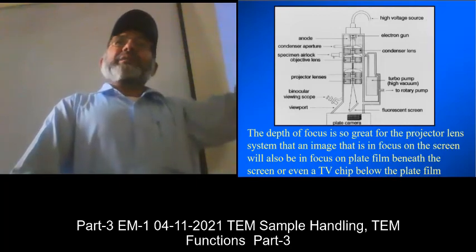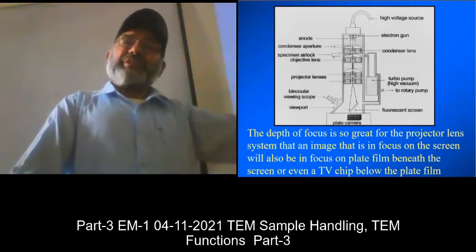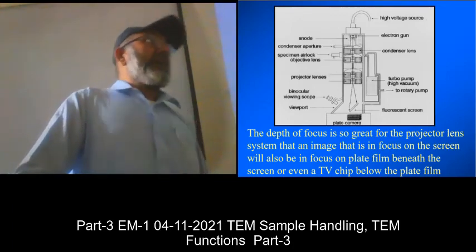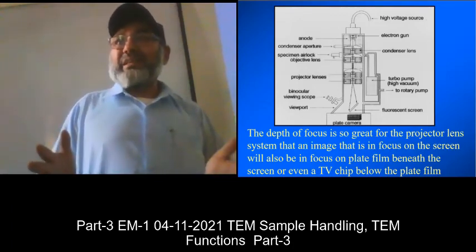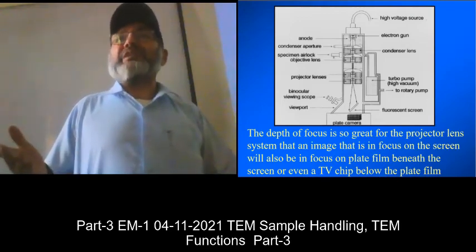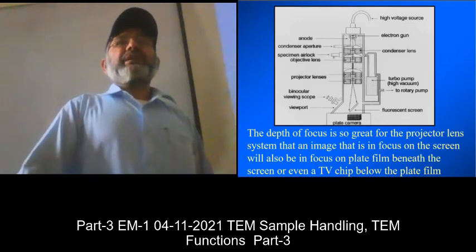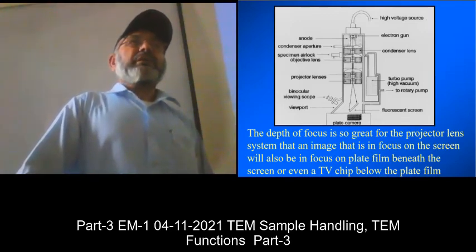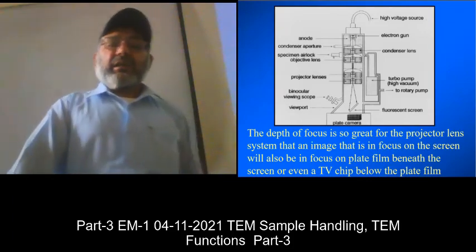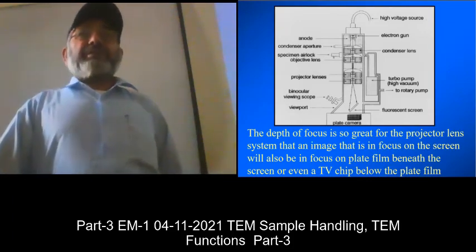So if you are interested in angstrom level features, and the camera cannot resolve a nanometer scale thing, then obviously the information is lost. And that is why very high resolution cameras are used for recording the electron microscope images and diffraction patterns.